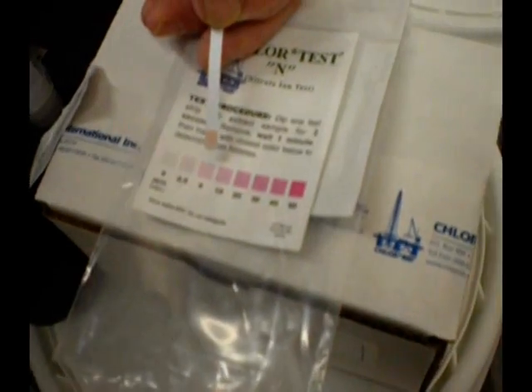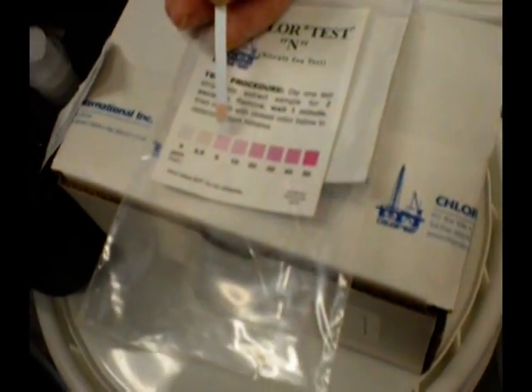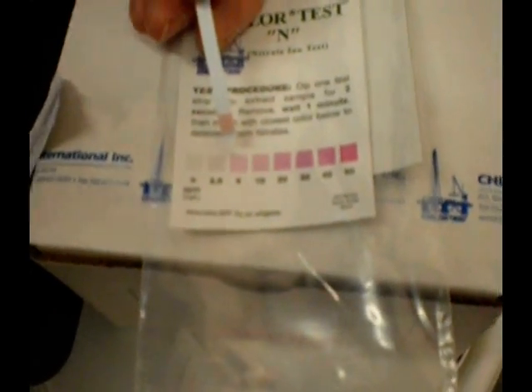We can see the color change already. The surface we sampled — even though we did not massage it for the full two minutes, just to avoid spending too much time on this in the video — we are still picking up nitrates.